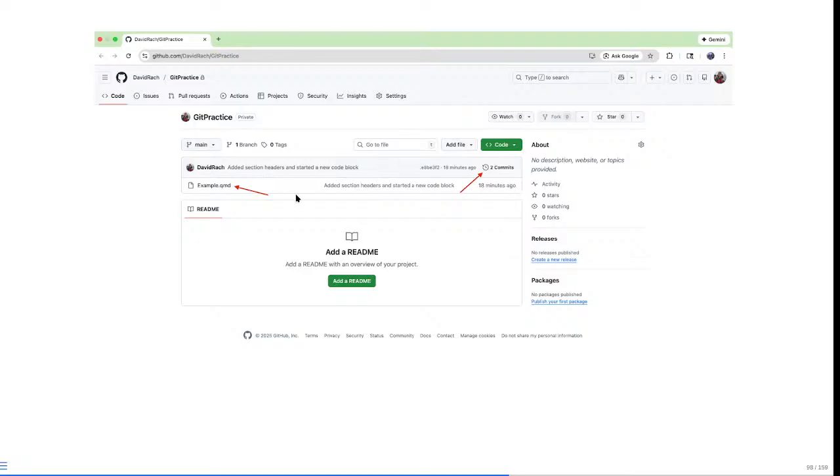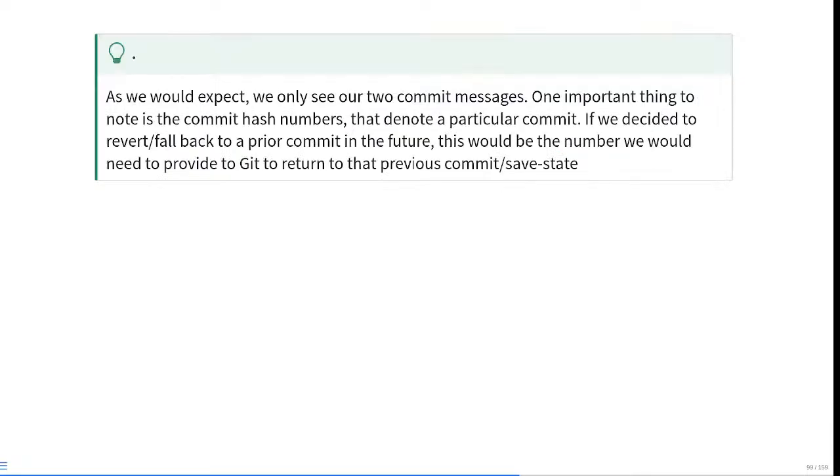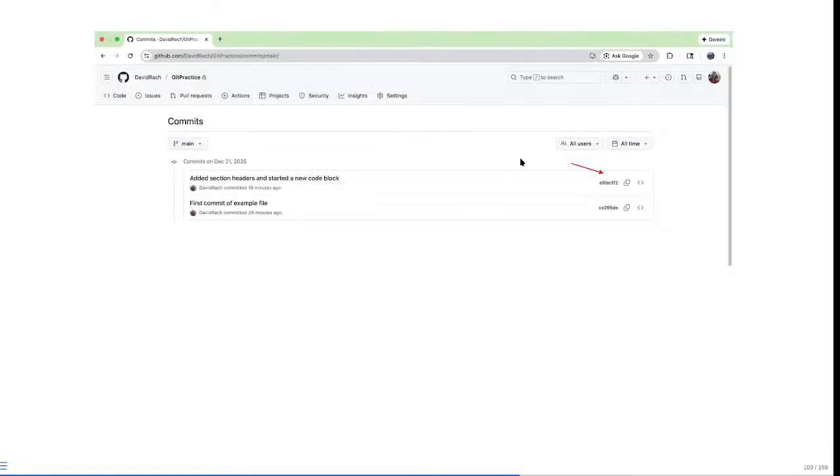All the files that we have actually staged and committed are now present on the remote on your GitHub account, where they're backed up and secure in case you need them for a different purpose. So if you click on the commit option, which was this one right up here, you'll basically see what we used to be seeing within the primary left sidebar, but you'll see it in a slightly different view.